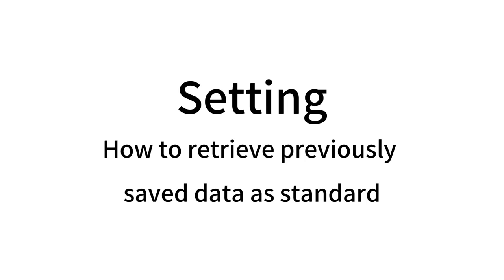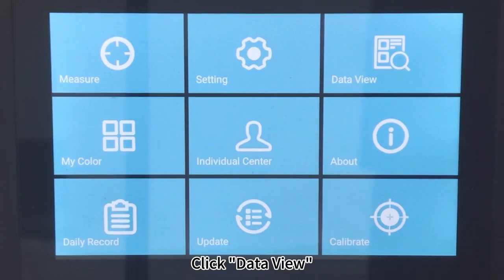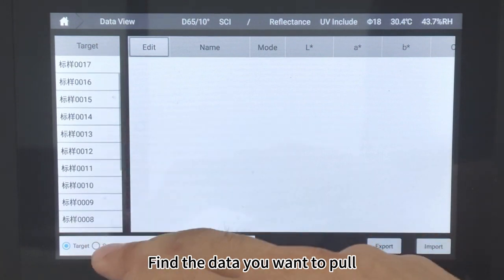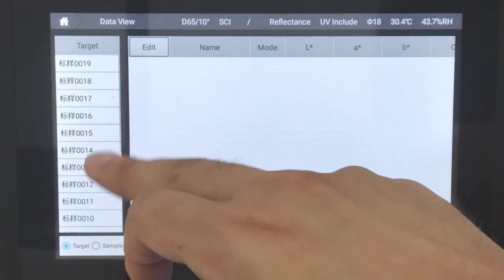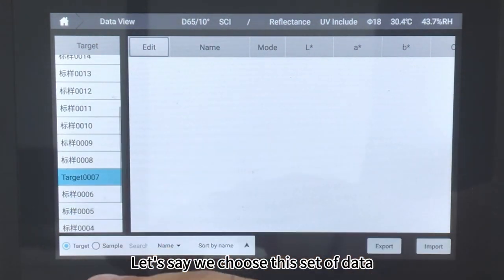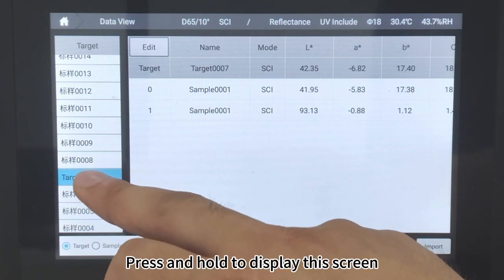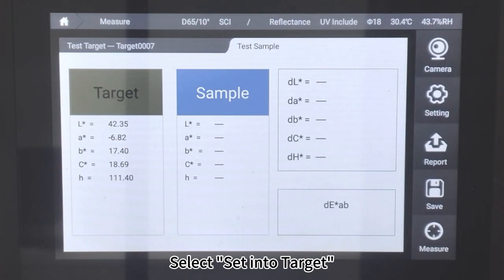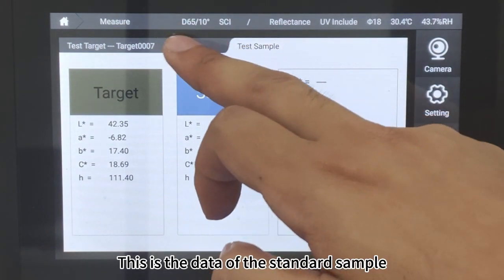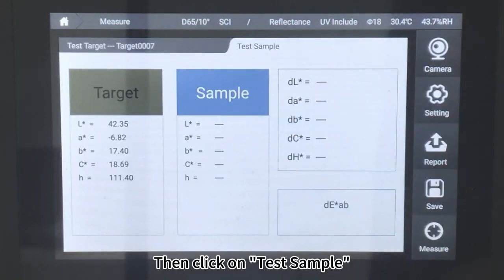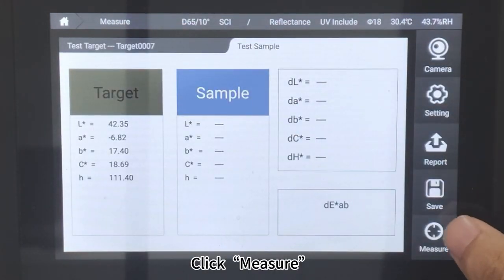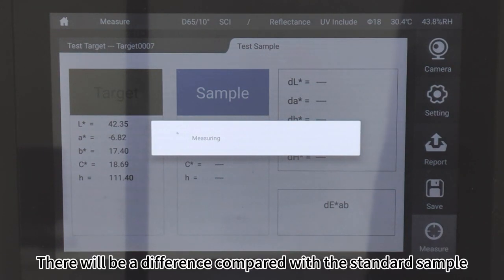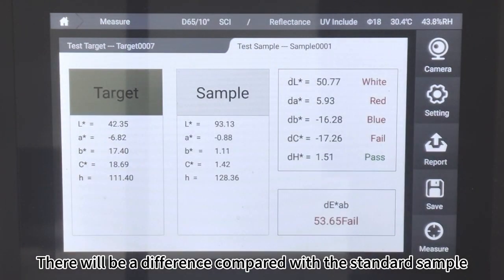How to retrieve previously saved data as a standard: Click Data View and find the data you want. Select the desired data set, press and hold to display the options screen, and select Set into Target. This sets it as the standard sample data. Then click on Test Sample and click Measure — the color difference compared with the standard sample will appear.